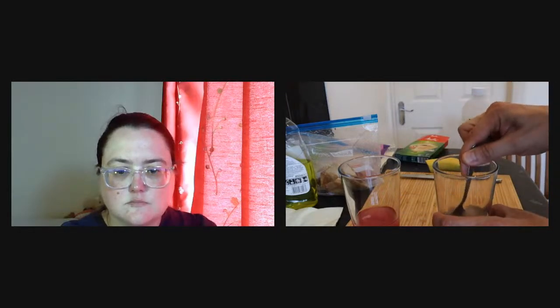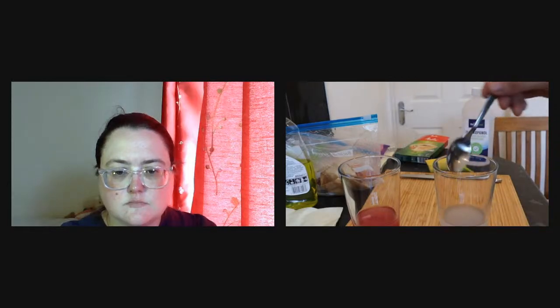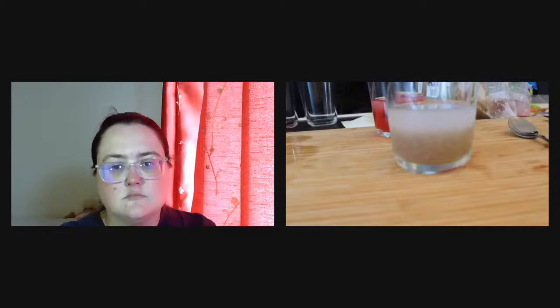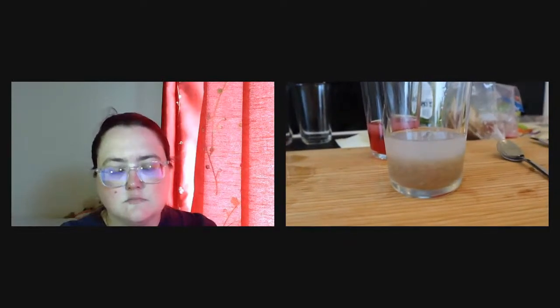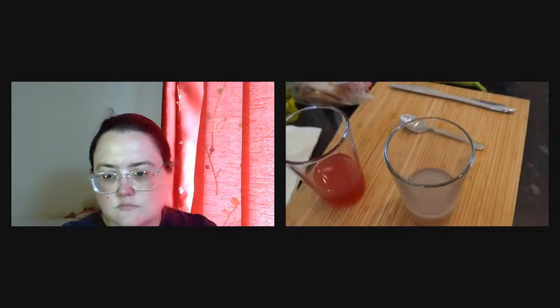It looks like there is less DNA for some reason today in the extraction of the banana, but you have some of those little clouds. The clumps are much smaller, so it's difficult to fish them out, but you will be able to see that you have some clumps forming in there, and you can also extract the DNA from the banana. I'm going to put you back in here again.